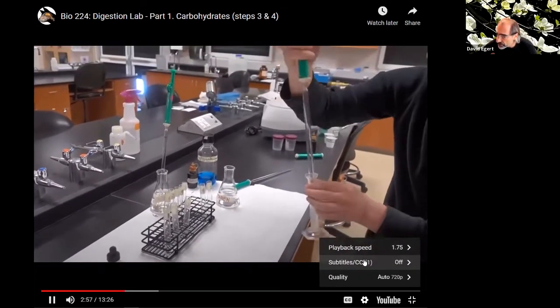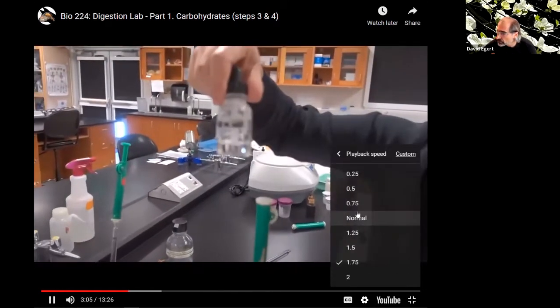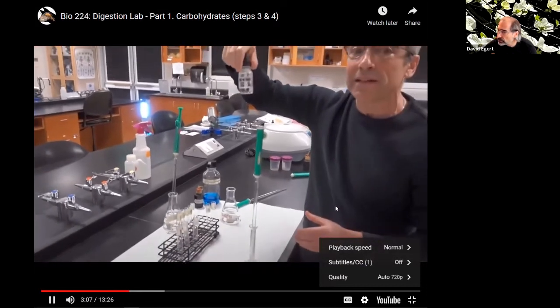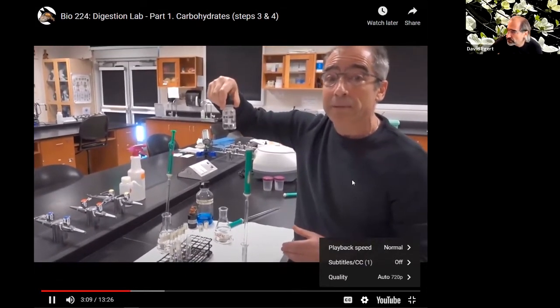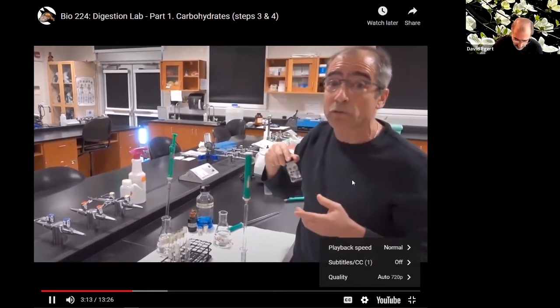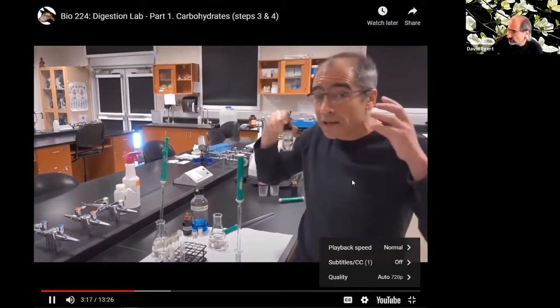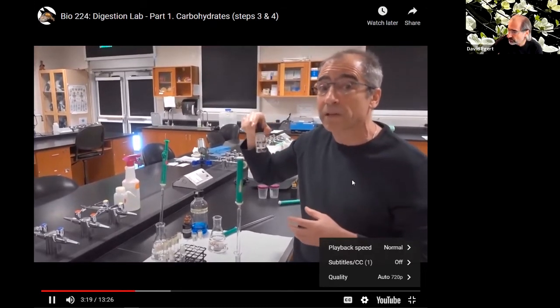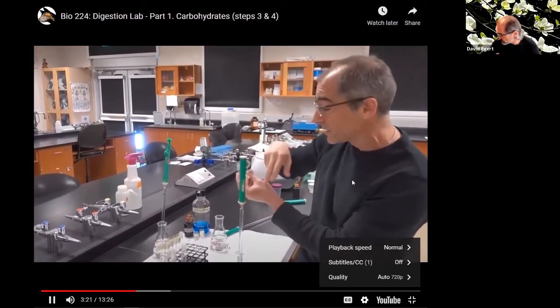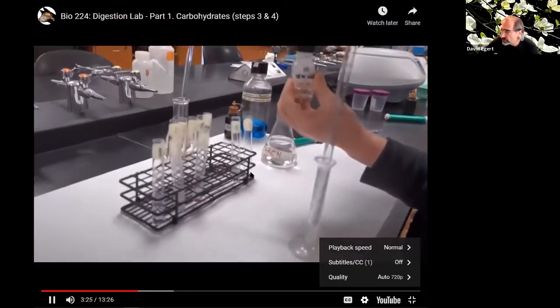For test tube 3, before we add the saliva in, we are going to decrease the pH by using this concentrated hydrochloric acid. This stuff is something you've got to be careful with. You should not be using this without wearing eye protection. Regular glasses can work. If you don't wear glasses, you've got to be wearing goggles of some sort. This can damage your eyes, your skin, your clothes, or anything. So be careful with it.